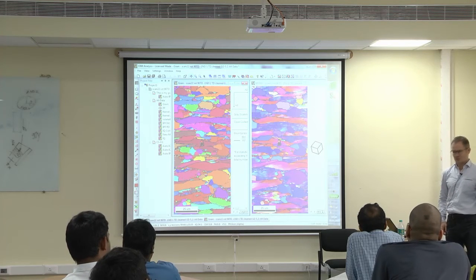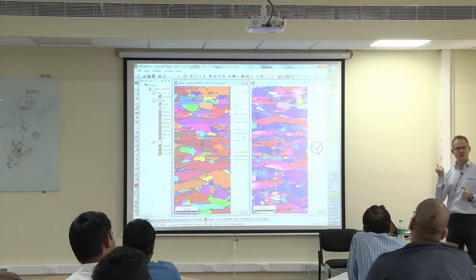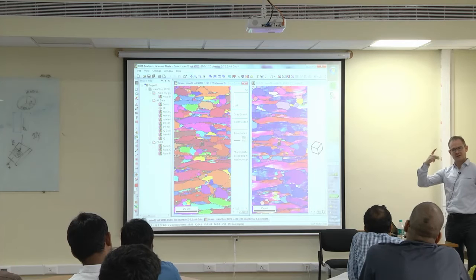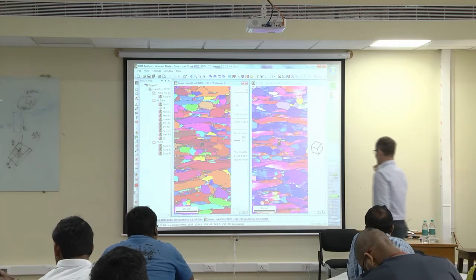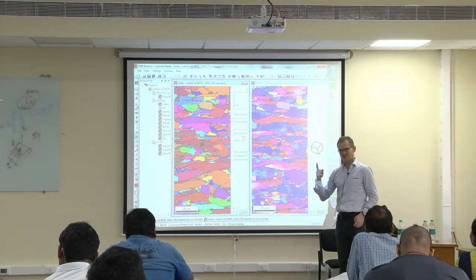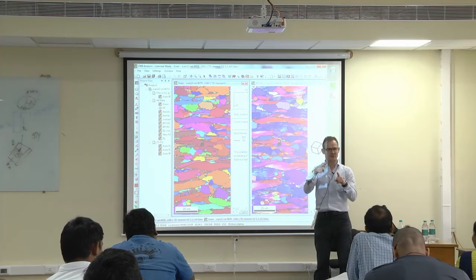I have started writing, or I wrote, software which includes more human knowledge. This is kind of stupid software. It just does simple calculations of misorientations and does not consider anything else. But you can say, let me consider a grain to be something which is connected to the other pixels by certain rules.